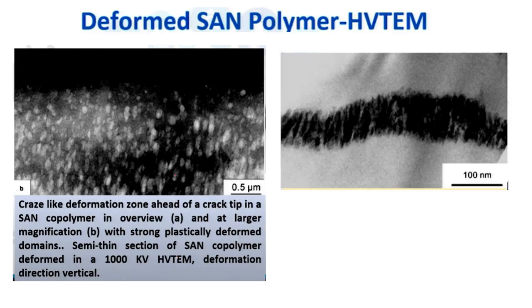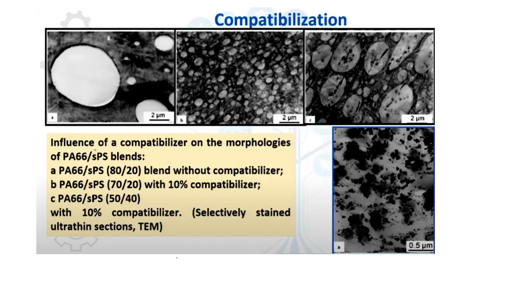And whenever a crack is taking place, how the crack is propagating, if you want to check, or after cracking, if you want to investigate from where the crack is generating, that idea you can get from the TEM.